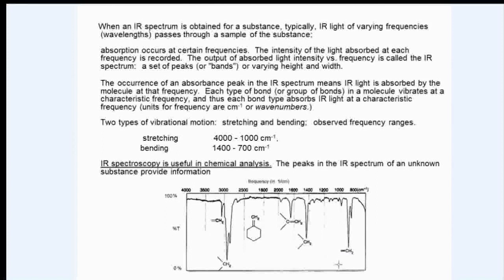So if we look at the spectrum from left to right, the first peak we see appears to be about 3050 units. That's caused by an alkenyl CH stretching motion. This alkenyl CH stretching vibration is absorbing a photon at that frequency, creating that narrow, sharp, small peak at 3050. The next peak we come to, moving from left to right, is a larger peak.